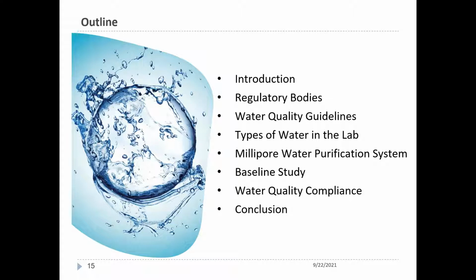Then we'll look at a baseline study. Why are we making so much noise about the quality of water? What's the real impact? What does it mean? We'll look at the water quality and compliance, and then together we'll look at the importance of the quality of water in the laboratory.